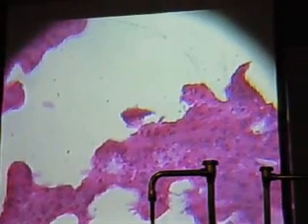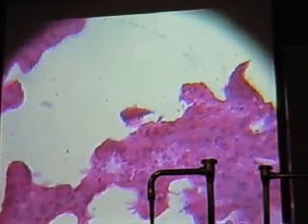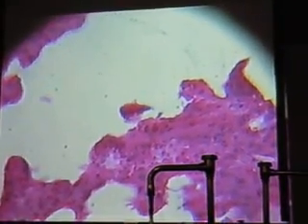What organ is this? Lung. Open space is the alveoli. If you look, cell type, squamous. Cell arrangement, simple. There's the best example right there. Okay. What's the function of simple squamous in this organ? Diffusion of gases. Where this whole thing is an alveolus, right? So oxygen diffuses from a higher concentration into here and does that.